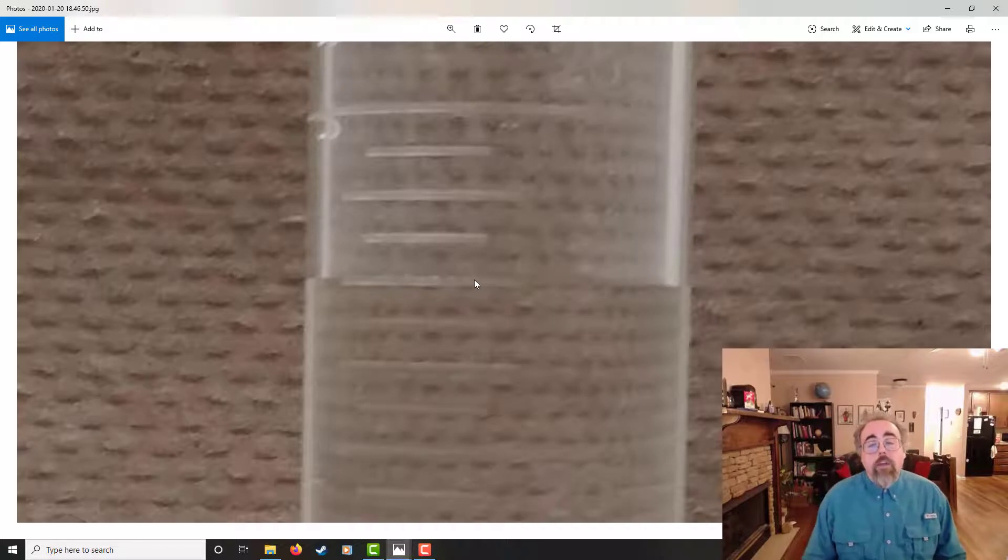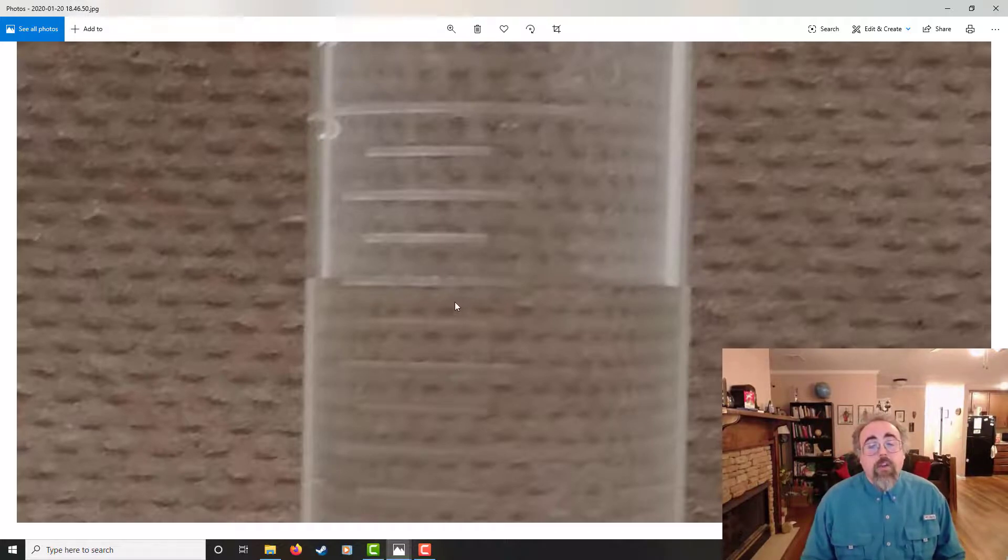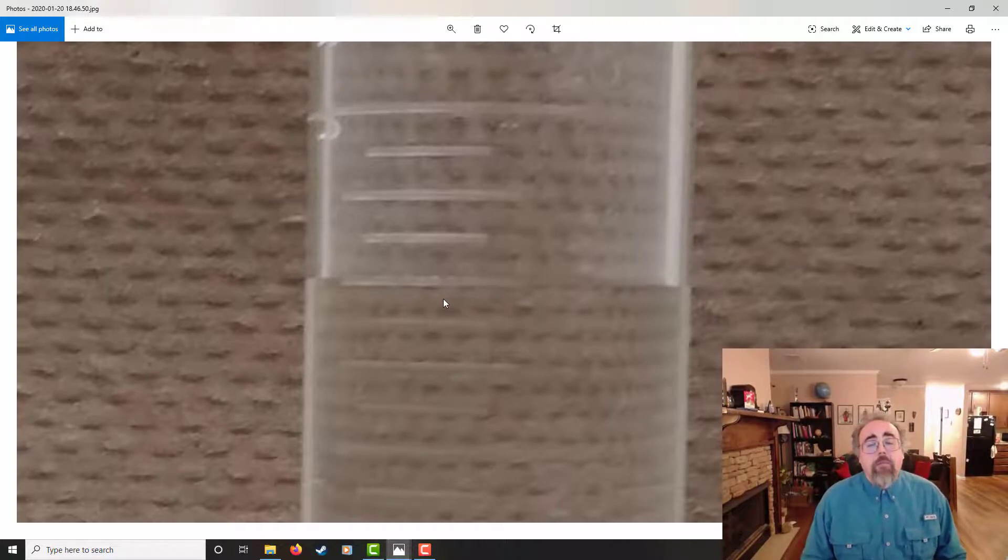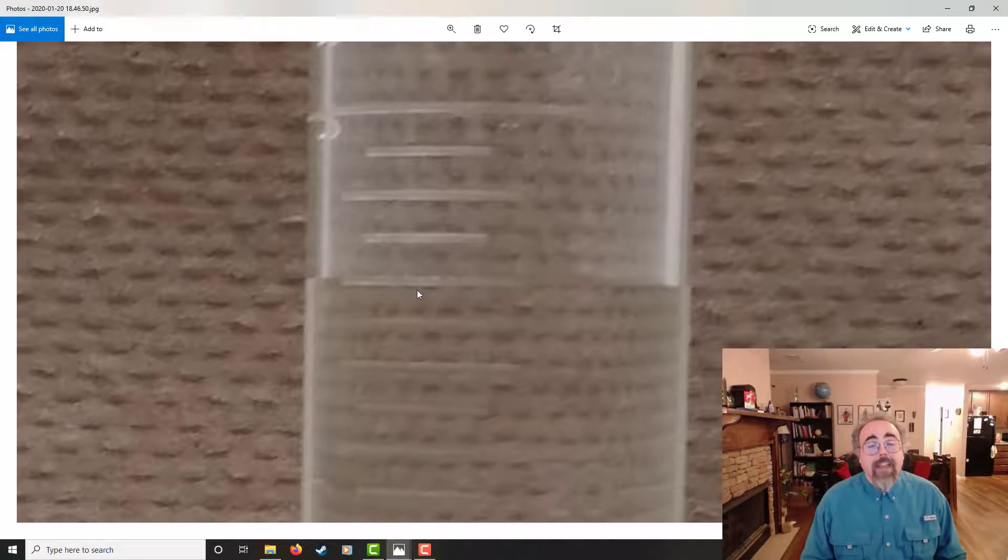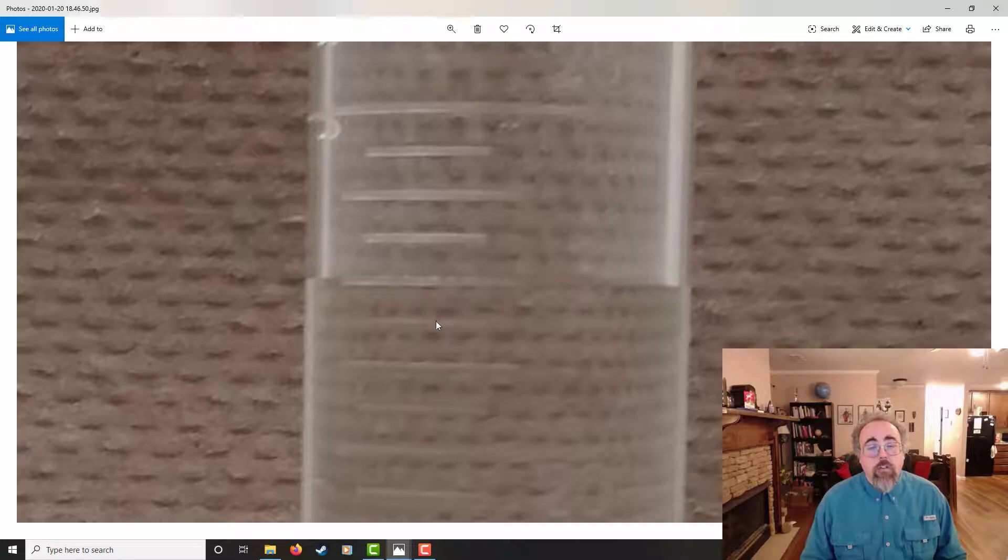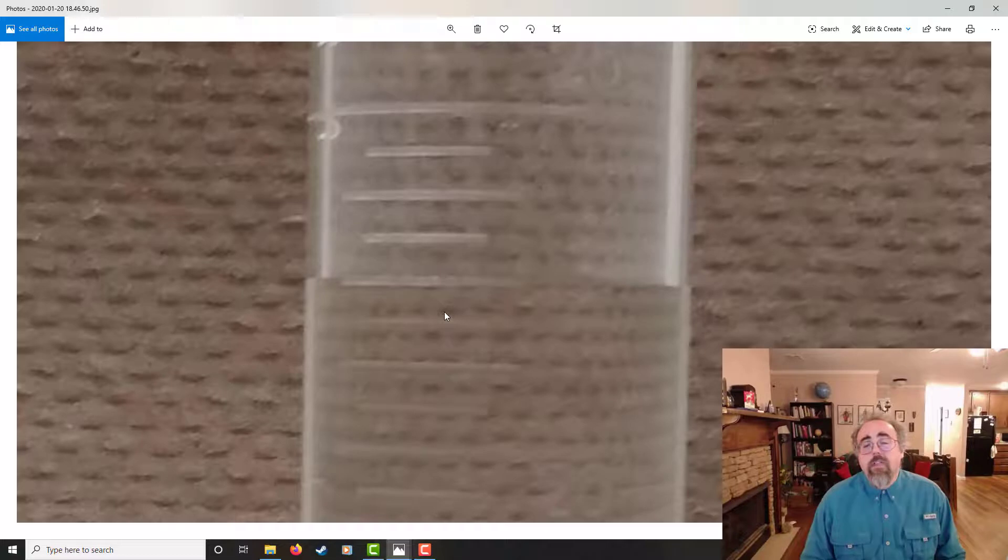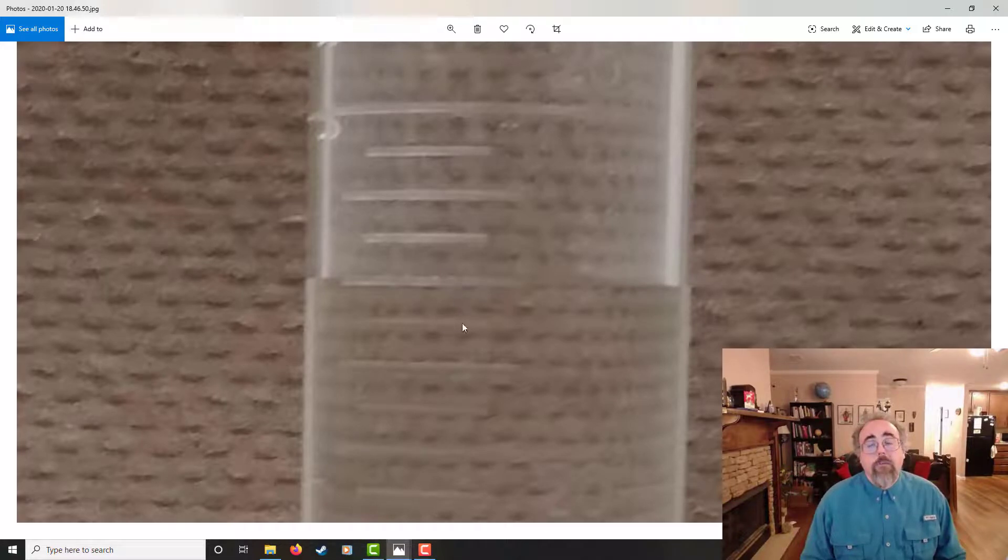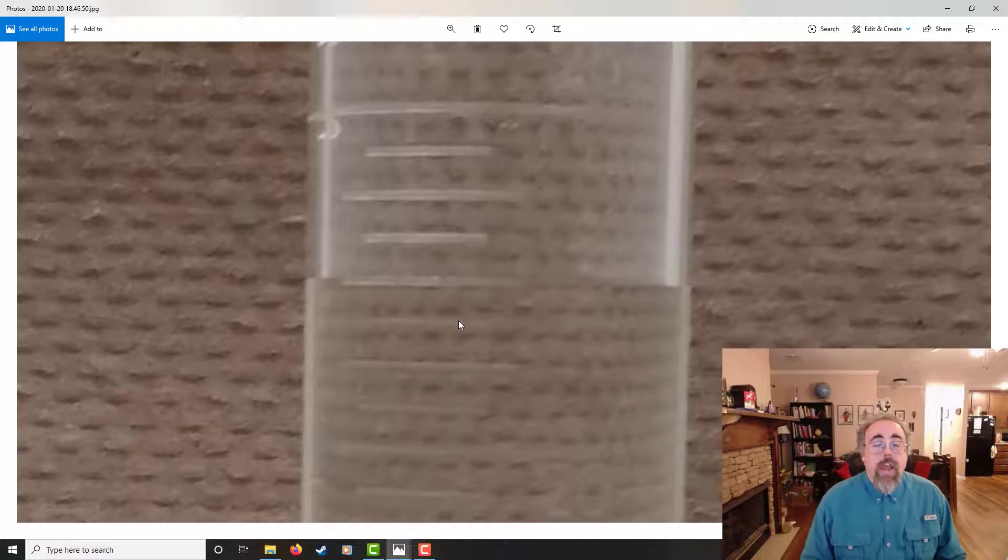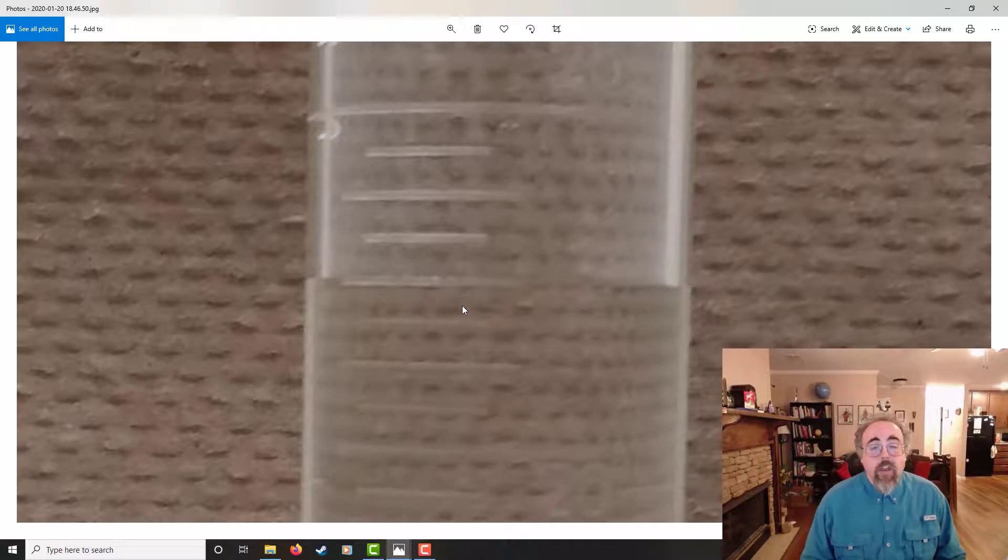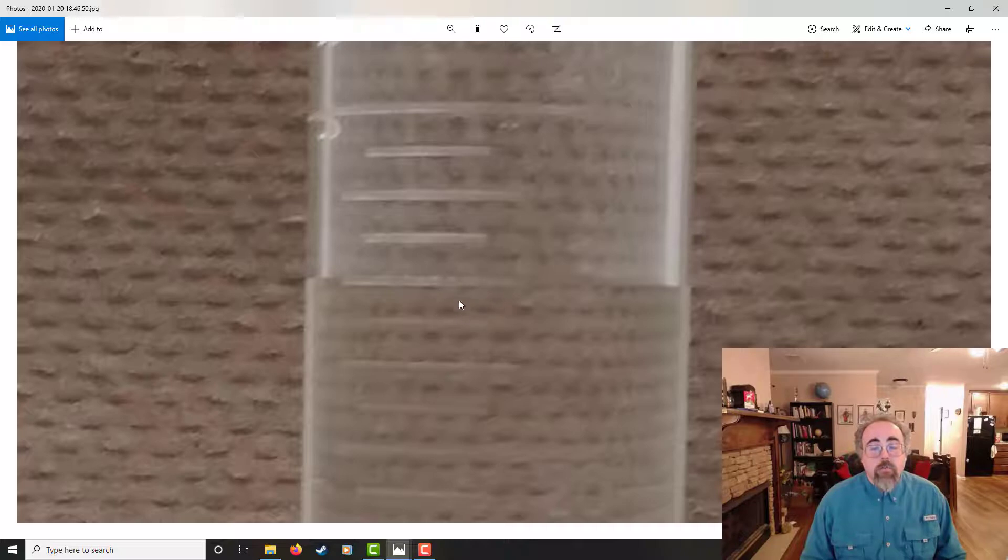Now, if the meniscus was down here or something, I wouldn't try and add a full 1 to 10, because this is the 0.5, 22.5, that's the 23. So I'd probably still only do three sig figs, because I don't think you could trust any more than that. But this would definitely help you. So there would be 22.5, there'd be 22.7, 22.6, 22.8. My point is probably in the wrong spot, but you get the idea.